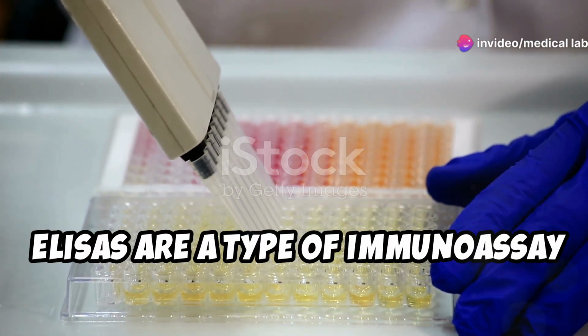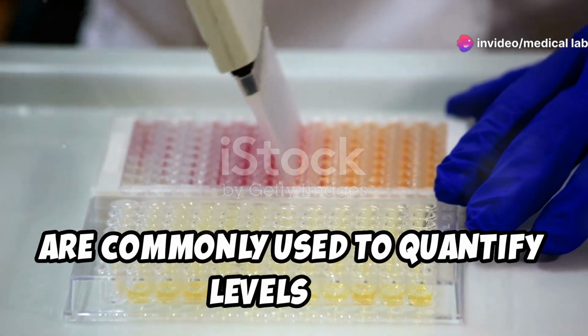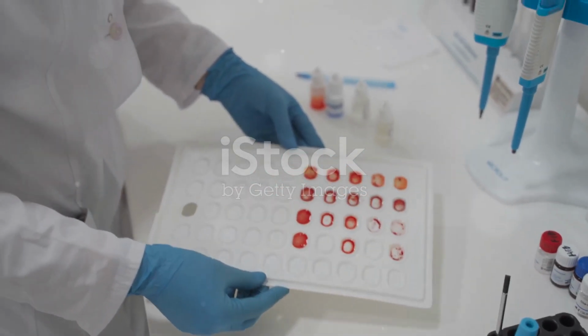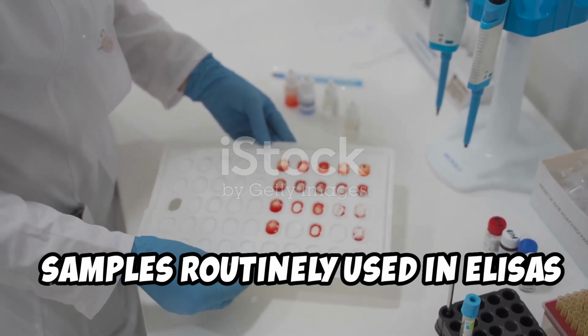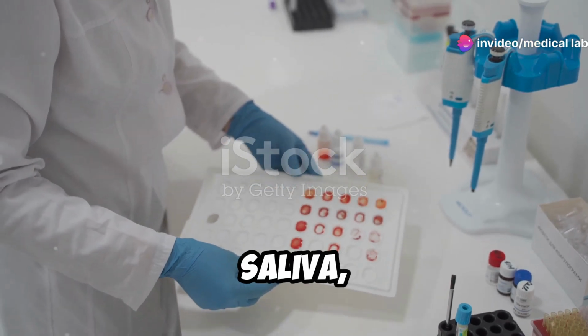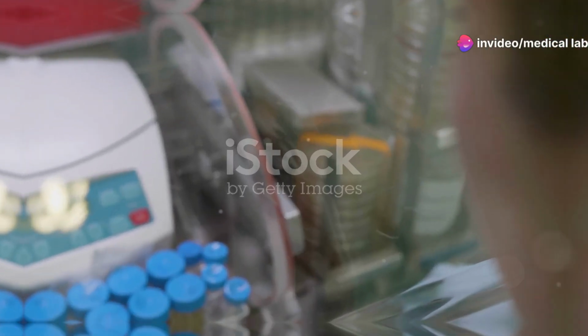ELISAs are a type of immunoassay that are commonly used to quantify levels of a specific target within a sample. Samples routinely used in ELISAs include serum, plasma, cell culture supernates, cell lysates, saliva, tissue lysates, and urine.